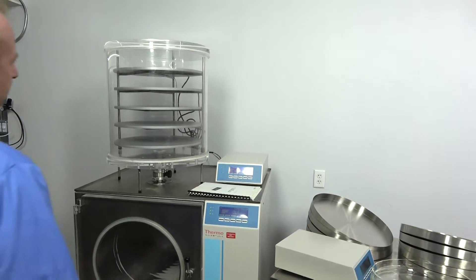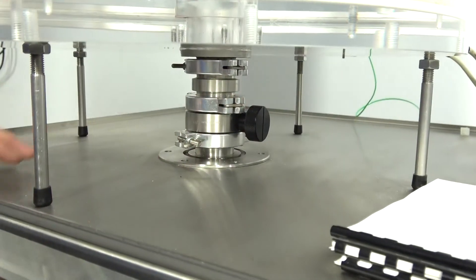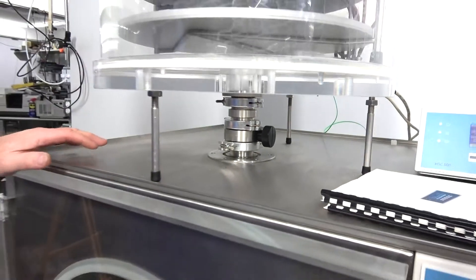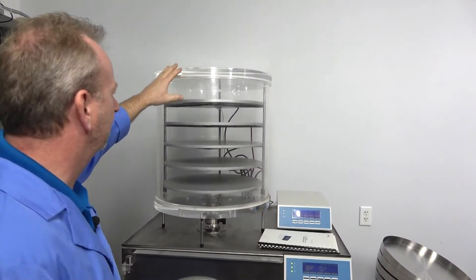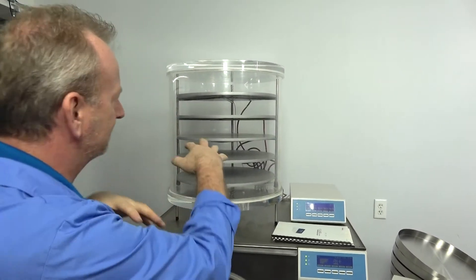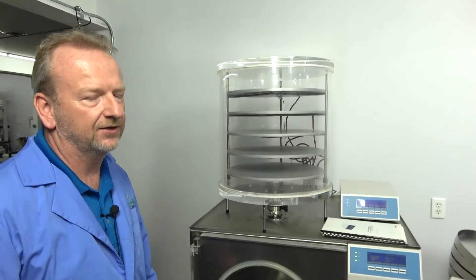One of the features of this unit is that it has an isolation valve where you can shut the valve off and isolate the upper chamber, so you can keep the lower section running and not lose your vacuum. Then you can make a swap — the lid comes off, you lift the plexiglass off, slide your trays in on each shelf, slide them out, and get ready for another run.